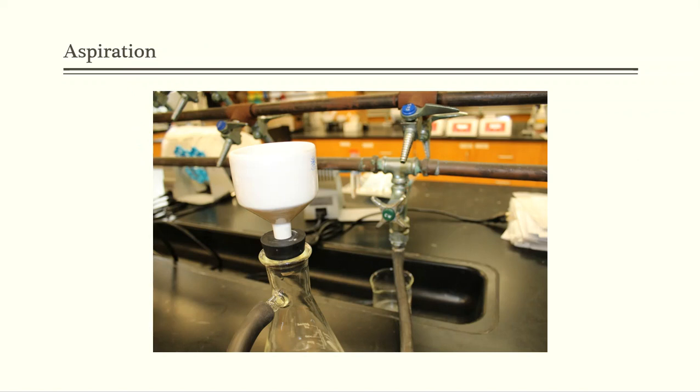You get a little bit closer look at the Buchner funnel that's up here. I call it a Buchner funnel. Other people call it a Büchner funnel. It doesn't really matter. It's tomato, tomato. I don't really care what you say, but I've just said Buchner funnel the whole time that I've ever been in chemistry lab, and that's just what I've kind of stuck with.